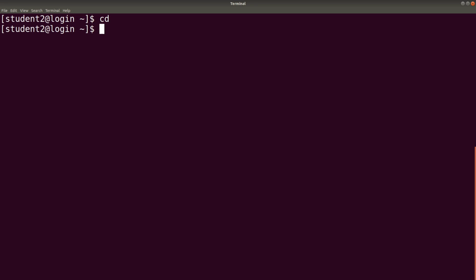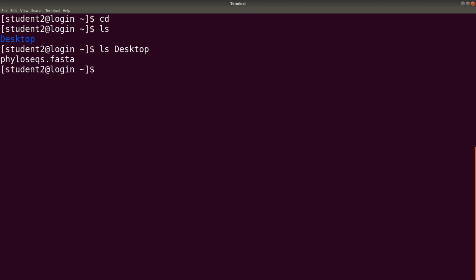So please make sure you also adjust these commands if you are using a different location. Now let's explore the data. We'll begin by issuing the ls command. The data was saved on desktop. And so we have it here.